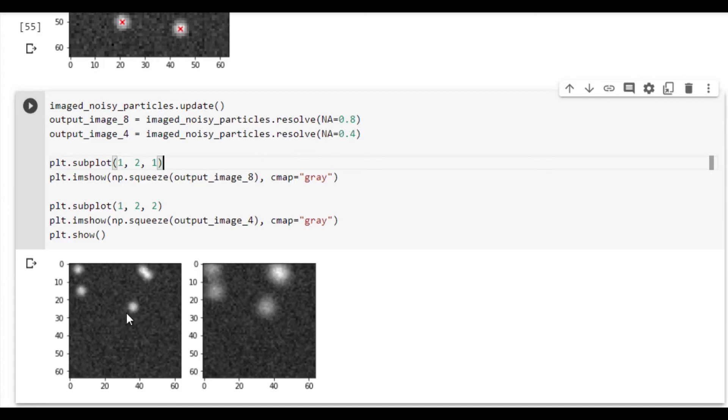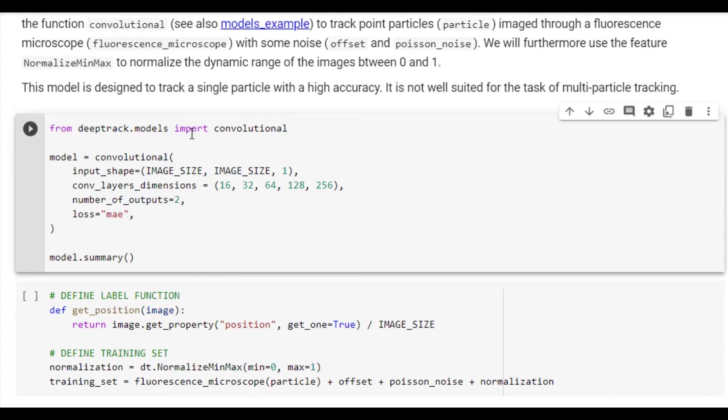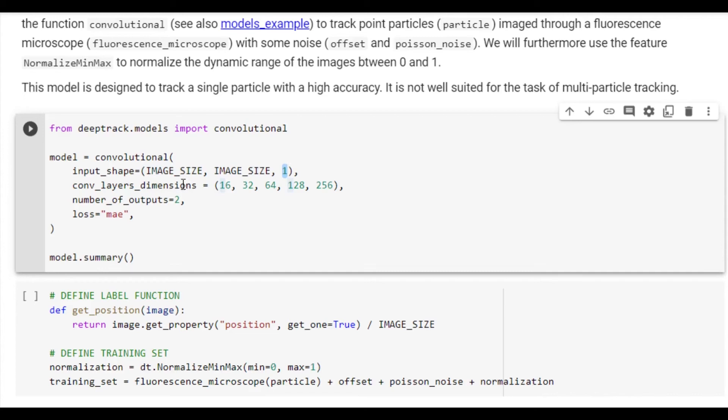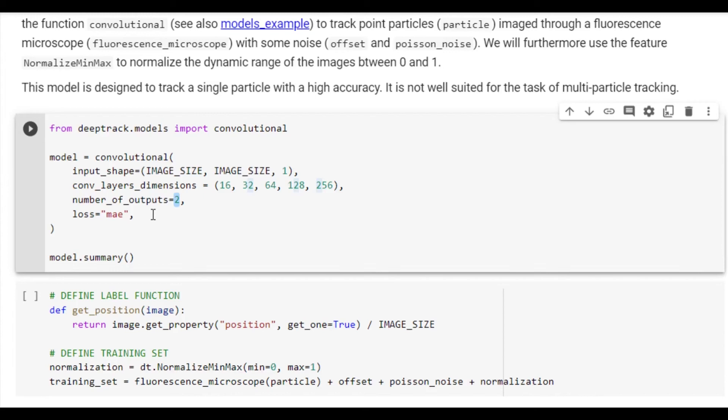Now we are ready to define the neural network. DeepTrack is compatible with any deep learning library, but it is designed to be used with Keras. We also provide some standard architectures so you can get started quickly. Here we will use the convolutional architecture, which begins with a few convolutional layers and ends with a few fully connected ones. We define the input shape as image size, image size, and that there is one feature channel. We also set the number and size of convolutional layers in the network. We specify that we want two outputs after the fully connected part, and we set the loss function to be mean absolute error. Finally, we also print a summary of the model.